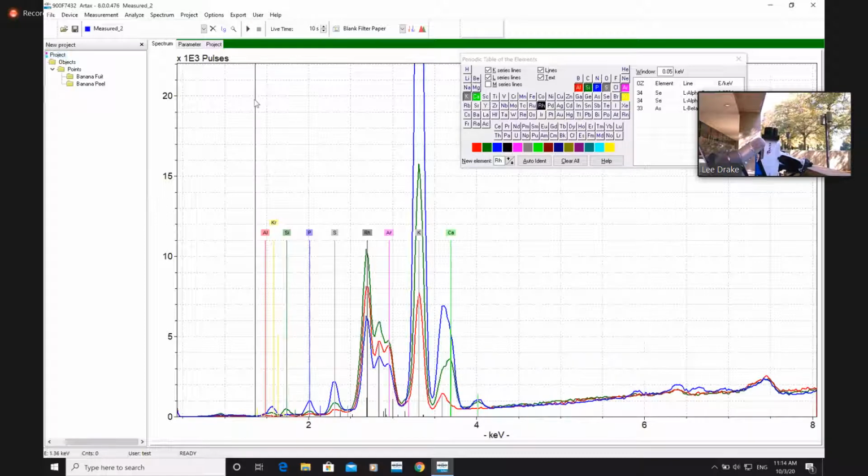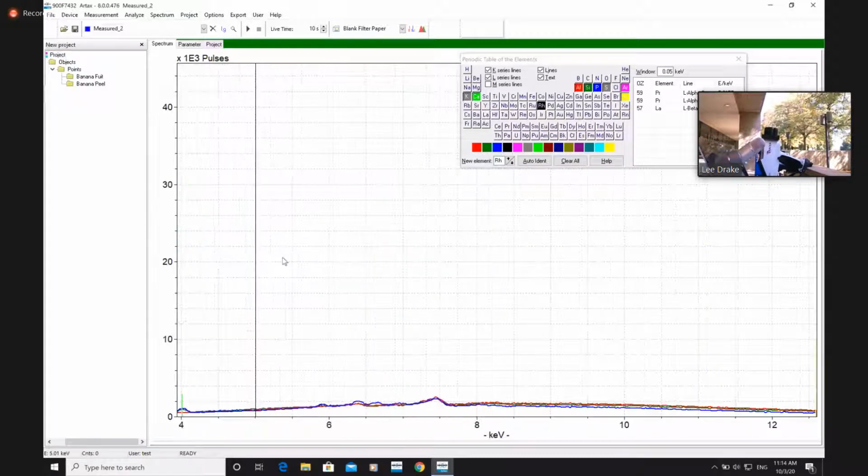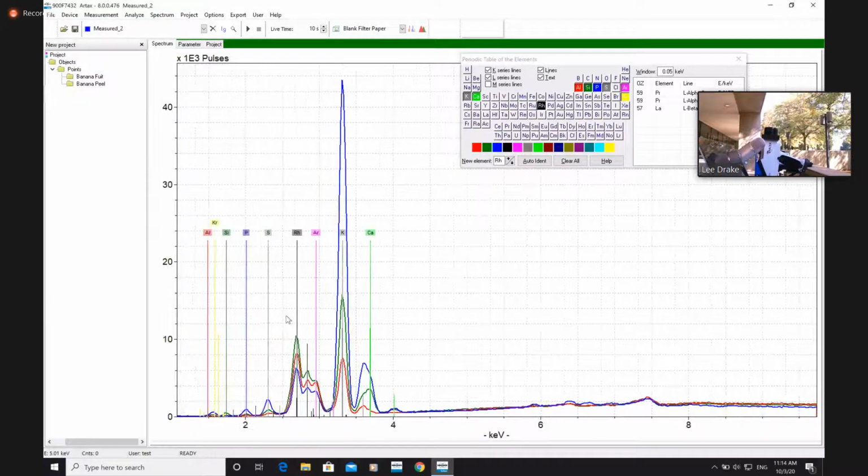All right. So, as you can see here, coffee has, what would you guys say that is? Like 4 times, 5 times as much potassium as the banana peel. Coffee is absolutely loaded with potassium. So if you drink a big cup of coffee in the morning, you're probably getting much more potassium than you are from the banana. To boot, the potassium in coffee is already digested for you.